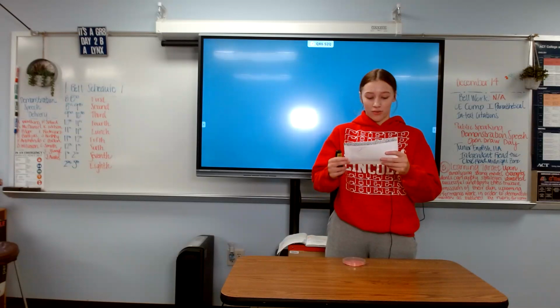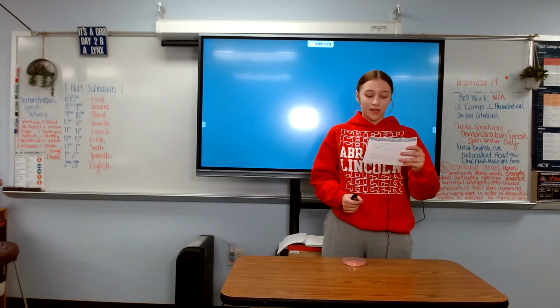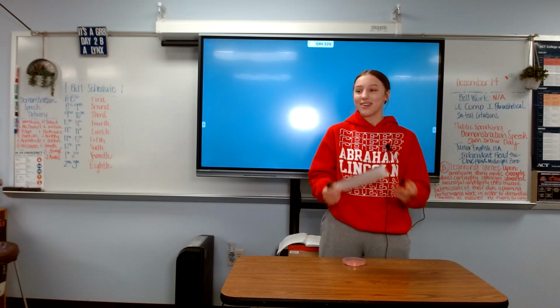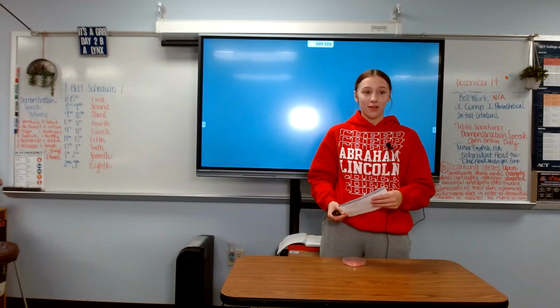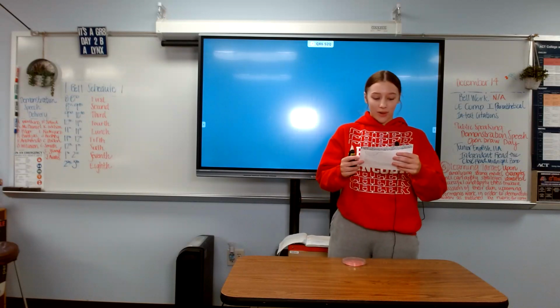So now that I taught you how to streak for isolation, I hope you'll all be mindful of the different infections going around this winter season. Maybe you might even go into this profession of a microbiologist. I went over the background knowledge you need, the materials you need, and then lastly, the benefits it has to the world.